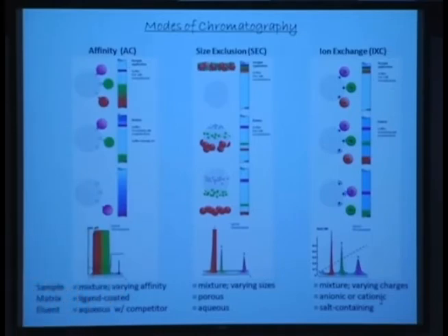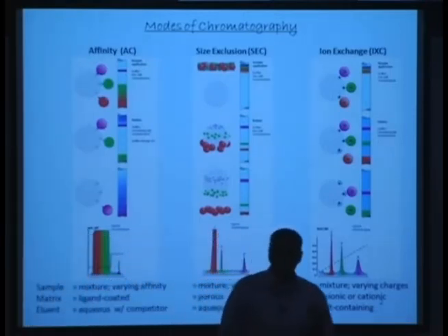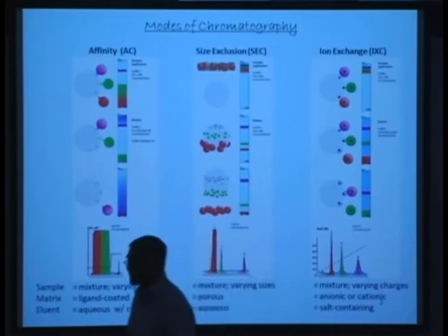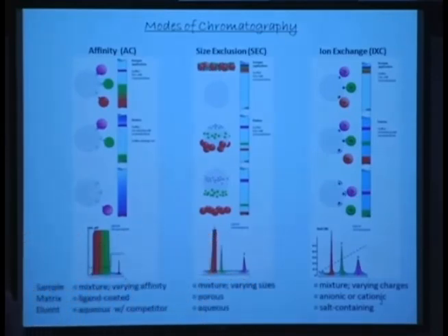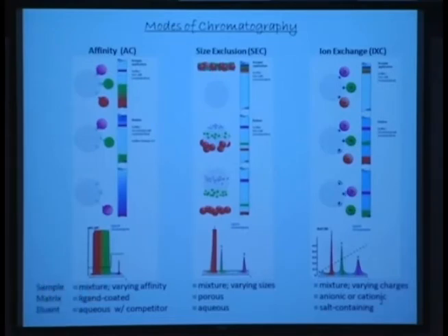Okay? You do have to utilize controls. Not only that, you have to utilize appropriate controls. Just as we saw yesterday in the carbazole assay, you can't really use completely different structural controls in carbazole. You have to use an appropriate control. If you are trying to quantify uronic acid in heparin, then for the most part you have to use a heparin-based control or a reasonably close control. Then the correlation becomes much higher.